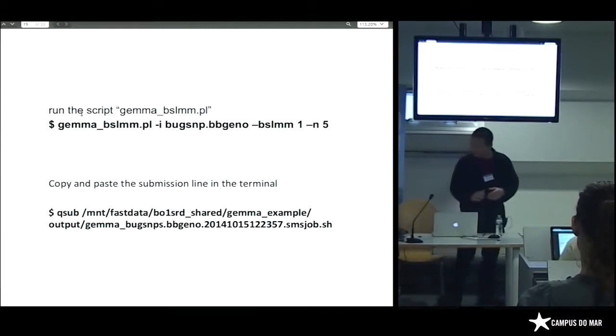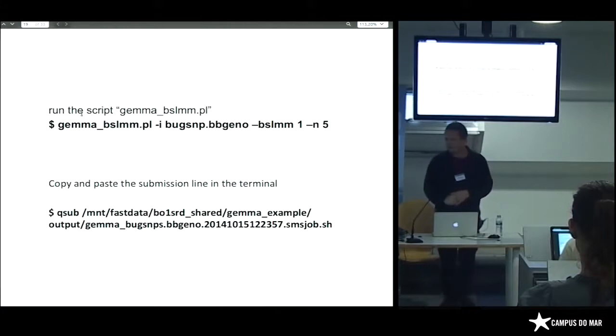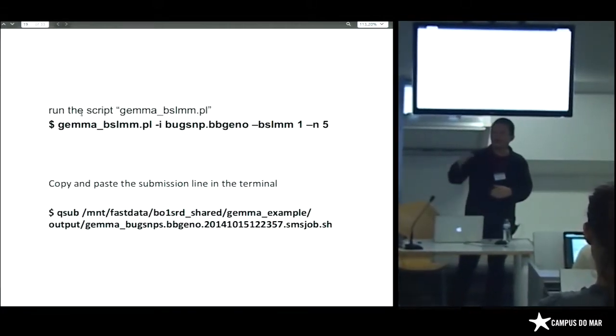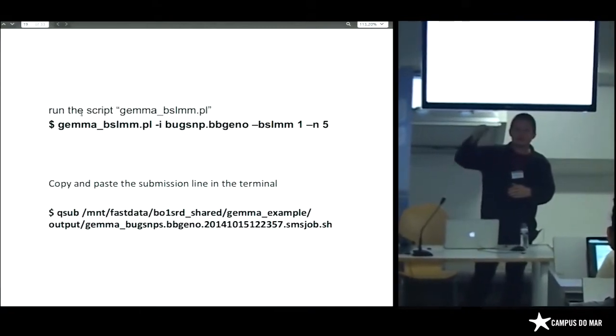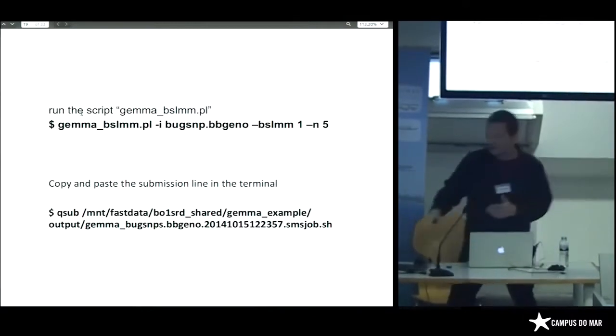So, did everybody successfully run that script? So now we need to run another script. And what I would recommend you do is use the up arrow to get back to the scripts thing. So you've got that whole path in there already. And then just take off the front bit. I'll show you what I mean.